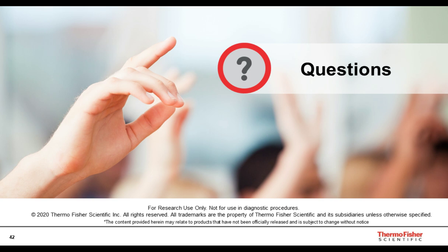Right. Okay, so this one has to do with the TrueTag kit. Can the resistance or selection insert, the puromycin, be removed after initial knock-in? So, getting a clean signal without the resistance marker. Yes. There are two ways that a user could solve for that.